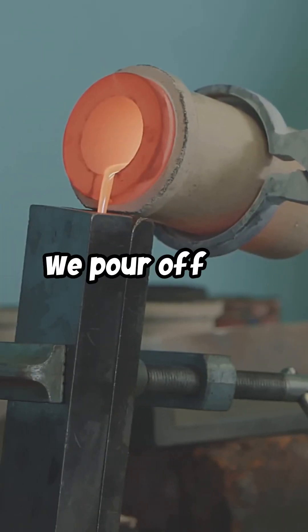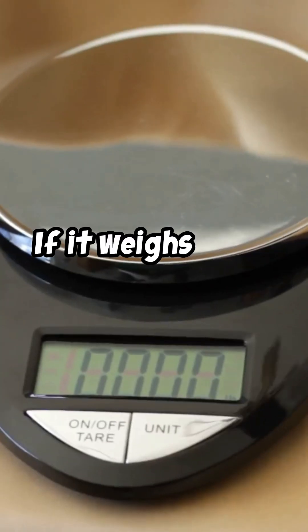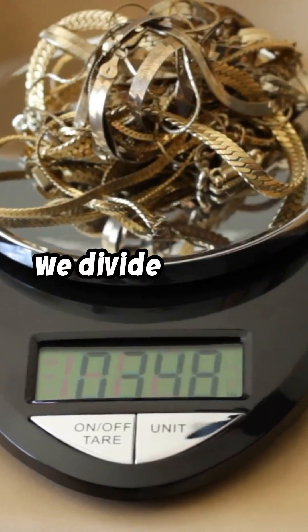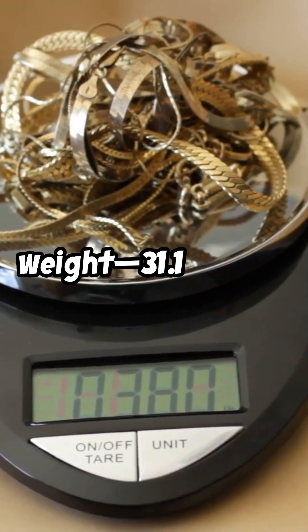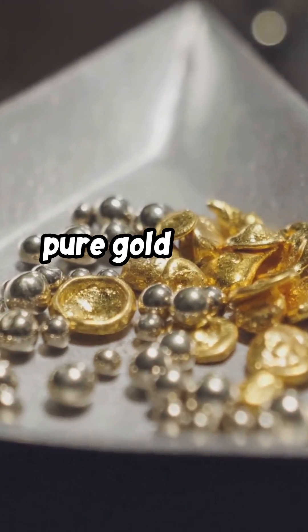After smelting, we pour off the molten material, leaving a solid gold bead. Now we weigh this bead. If it weighs 0.155 grams, we divide that by the original sample weight, 31.1 grams. This gives us 0.498% pure gold in the sample.